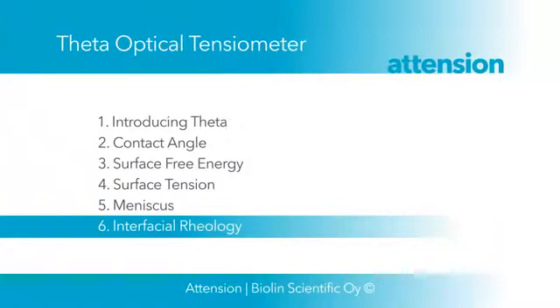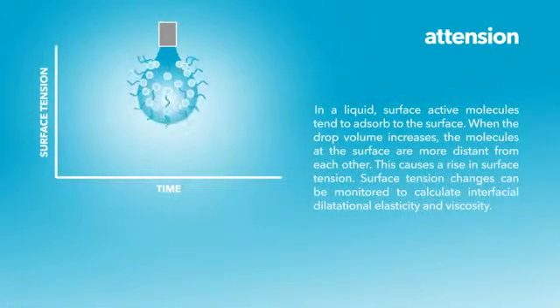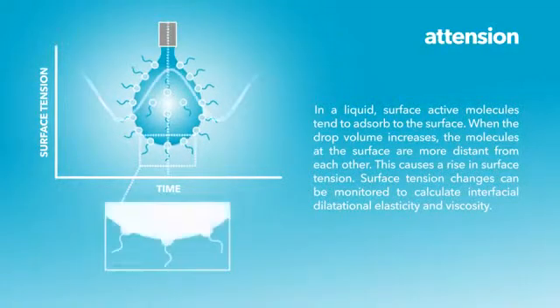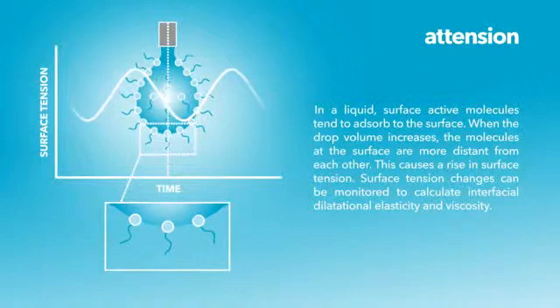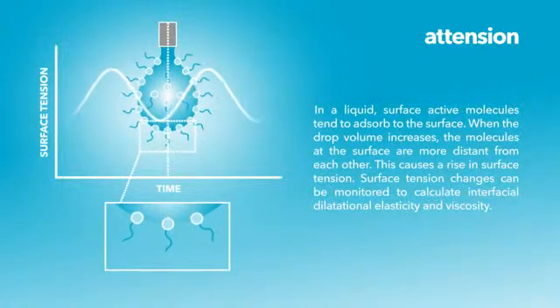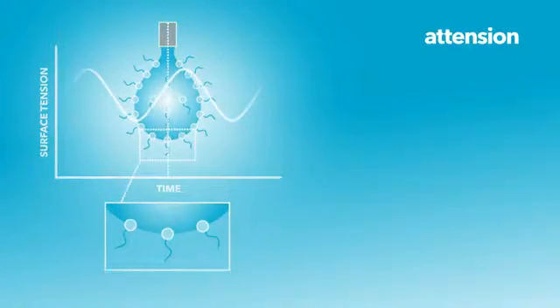Interfacial rheology can also be studied with Theta. In a liquid surface, active molecules tend to adsorb to the surface. When the drop volume increases, the molecules at the surface are more distant from each other. This causes a rise in surface tension. Surface tension changes can be monitored to calculate interfacial dilatational elasticity and viscosity.